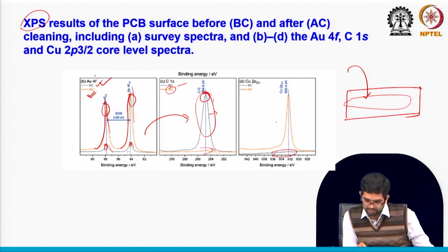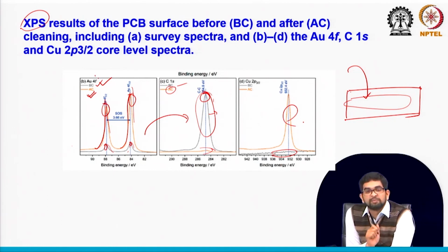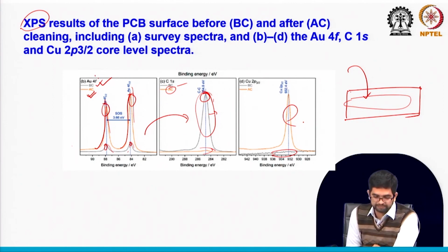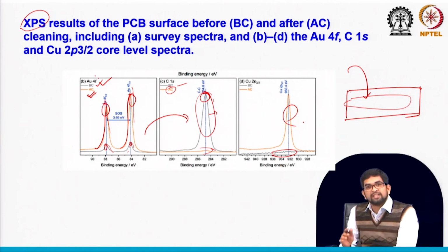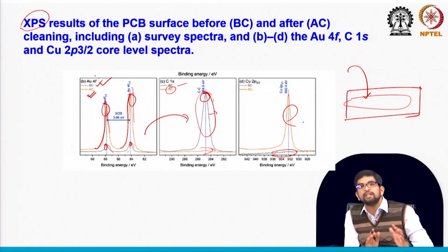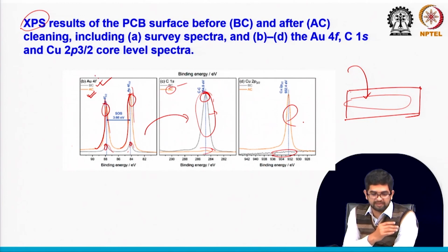Before cleaning there is almost no copper peak, but after cleaning we are getting some copper peak. It means you have to think about which pretreatment method to follow for removing the carbon contamination on your PCB surface. I taught you many pretreatment methods, right? Now you can link all the pretreatment methods to the removal of contamination from your transducer surface. That is why whatever I taught in the last few classes is equally important for developing the sensor surface. You may think of a very strong cleaning method like piranha, but you cannot use piranha because it can dissolve almost all the gold from the upper surface, and copper can be exposed.